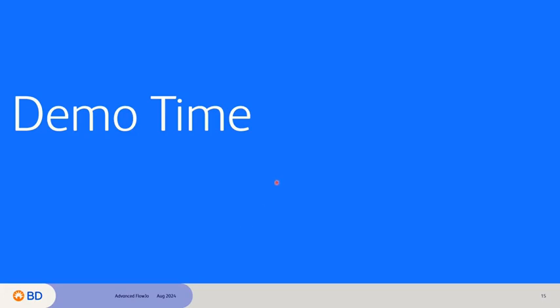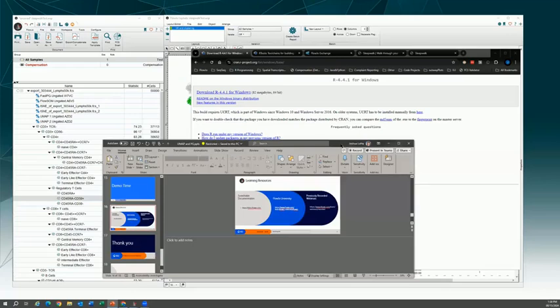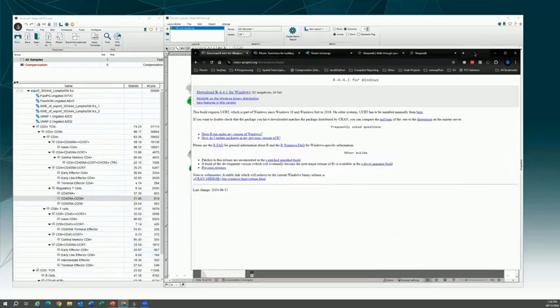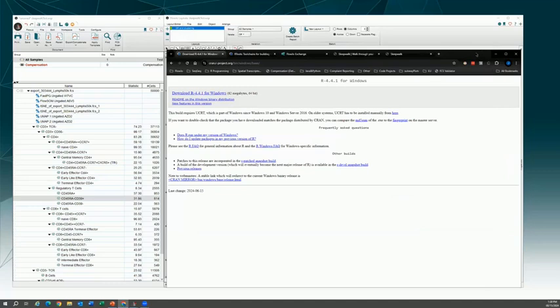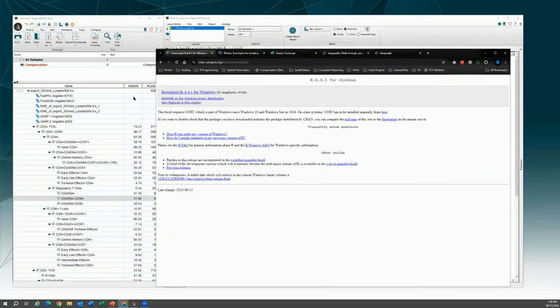Okay, so let's take a demo, starting with R setup, plugin setup, things like that. Right now I'm on a Windows machine. My Mac died, so I'm waiting for a replacement, which I'll be happy to get. This thing's pretty underpowered, so I have an analysis that's already done, because this machine just really won't work well for me.